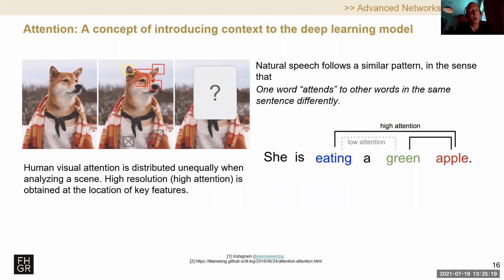What is important in this aspect is that it's not only the pixels that make up these vessels which need to be analyzed, but also the surrounding areas. This is something that people from the deep learning community like to call attention. Possibly a more commonly used name could be context. So you would look at the context of various pixels and see what is around those pixels. Do they connect to other pixels or not?